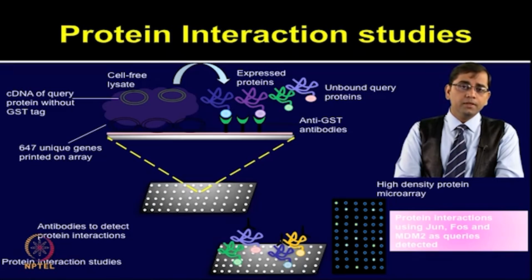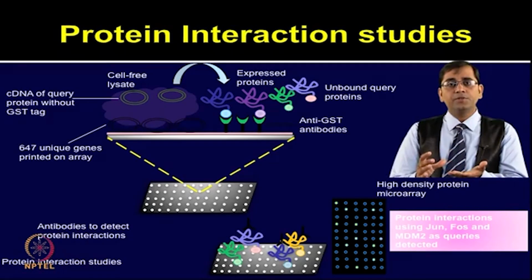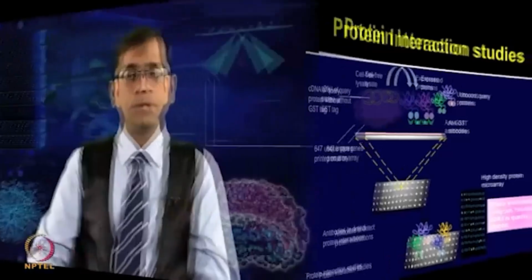In addition to showing that protein expression and protein interaction work, it was also interesting to perform the co-expression, where authors showed that even the query protein need not be purified, and one could express that DNA along with the in vitro transcription translation mix printed on the protein chip surface. So, if you have protein microarrays, features are printed on the chip, and then you have generated the contents by using a cell-free expression based system.